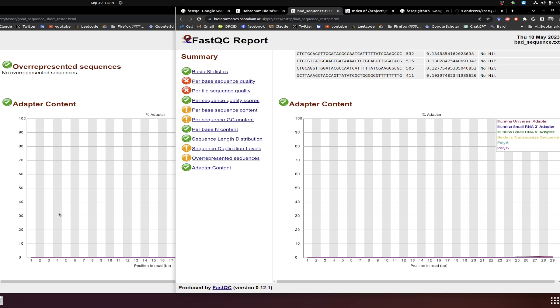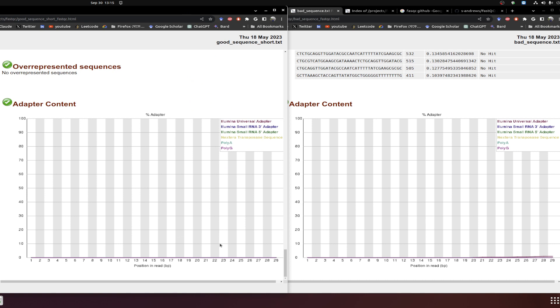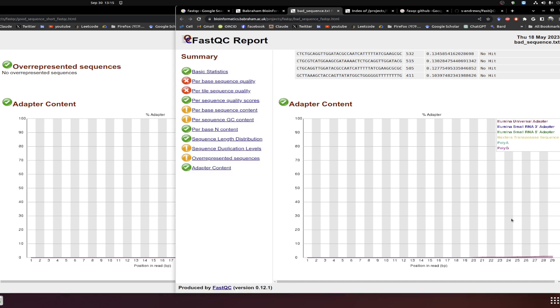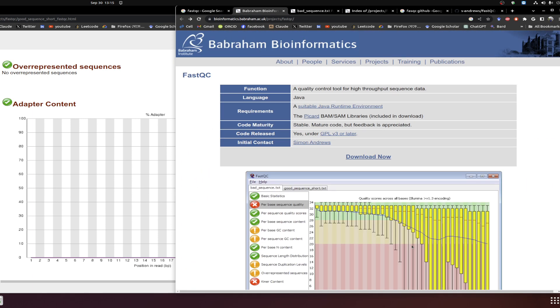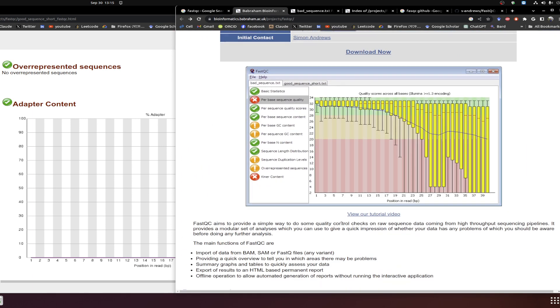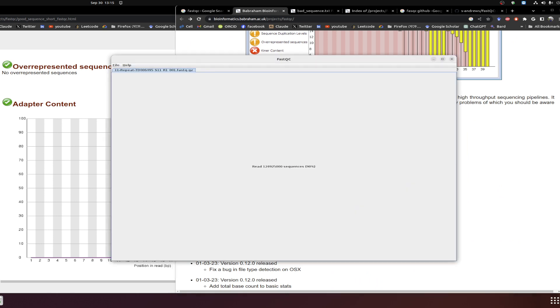The last module is adapter content. Adapter content issues arise from library preparation efficiency problems. You can see in the good example there is no issue, but in the bad example there is some adapter content present. These are the basics — you can always read more detailed documentation, which is well documented, and then let's go back to our analysis.